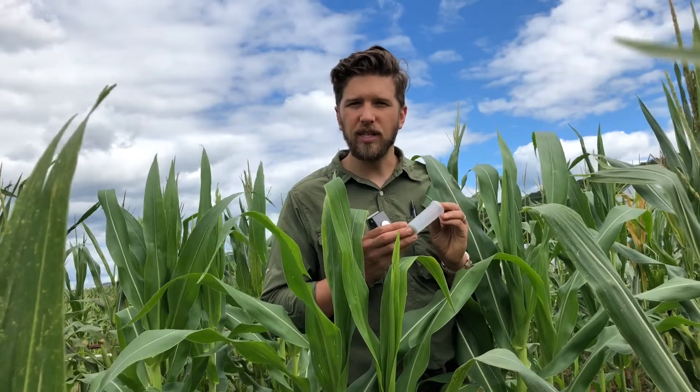Then we will dry and re-weigh these samples, so we'll get the fresh weight, the turgid weight, and the dry weight of these samples.